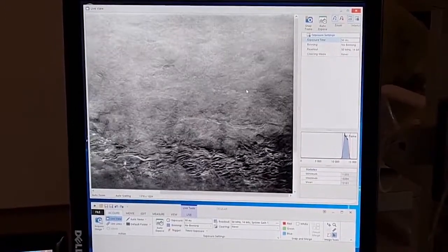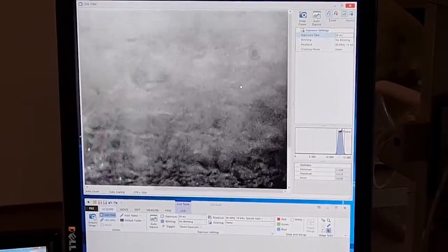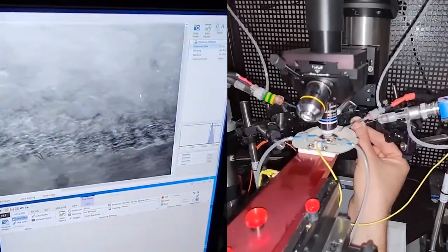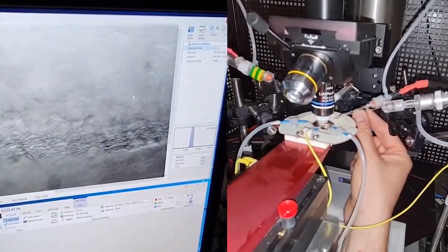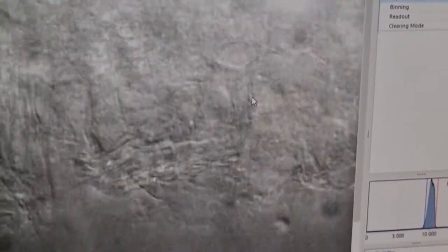On the roughly positioned LED that already gives a good contrast, you can further improve it by setting the three axes of the micromanipulator in a way that it gives maximum illumination in the center of the visual field. Turn the knobs and observe the changing intensity histogram in the bottom right of the image.